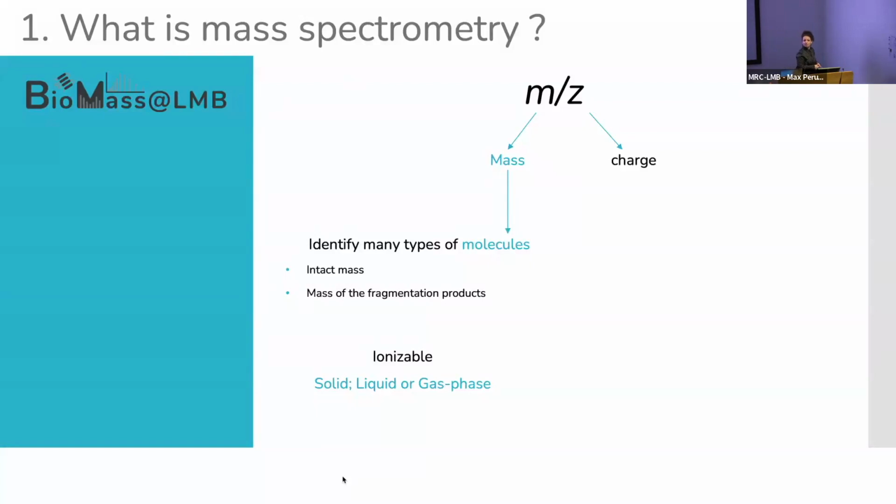So many molecules can be identified by their mass, but also many molecules are isobaric, which means they have exactly the same mass, so you end up with many solutions to one mass. What mass spectrometry also does is we fragment these molecules, and from the fragmentation pattern, we can build up which parts constitute the molecule. Hopefully one of these parts will be unique to that specific molecule, and we can identify the molecule.